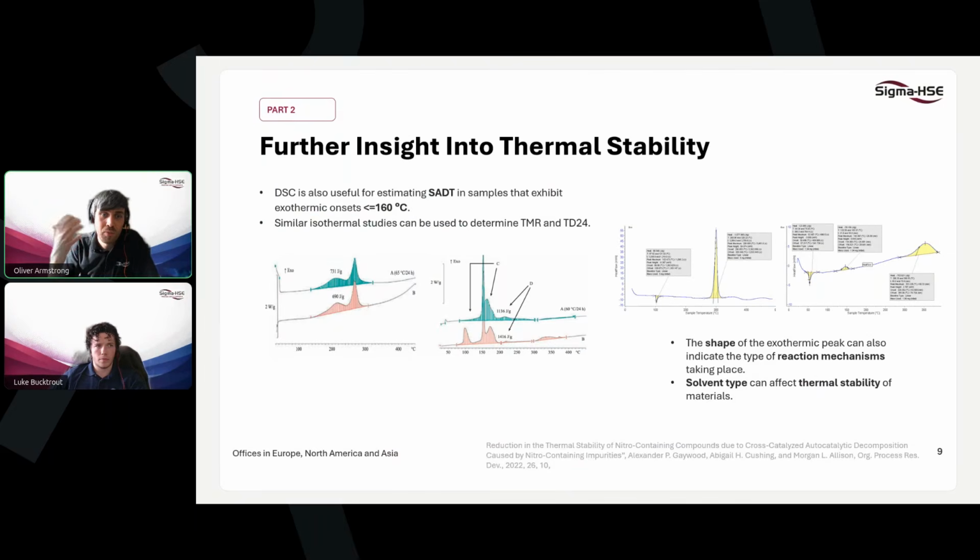So over and above the raw numerical outputs from DSC scans, with good knowledge of the test material and the sample, certain conclusions can also be drawn from the shape of the peaks. So not just the position of the peaks, but how sharp they are. If they have shoulders to either side, we can really read into that and start to point to different nth order reactions, or maybe autocatalyzed reactions, that may be present within the system.